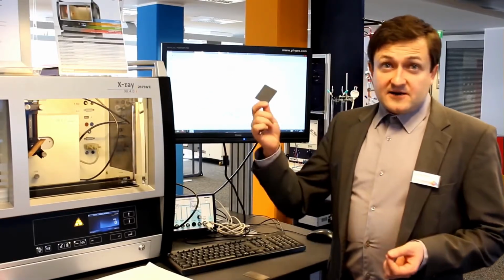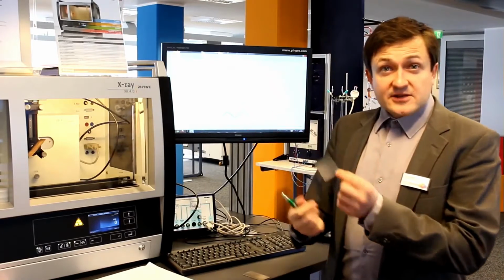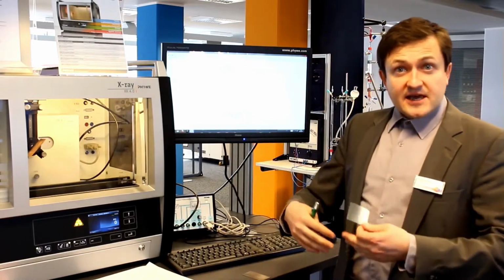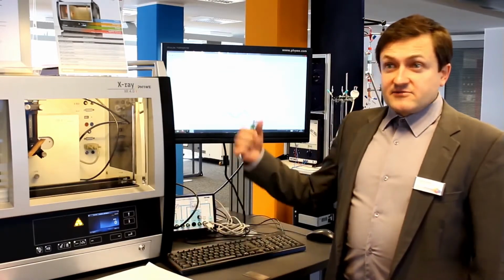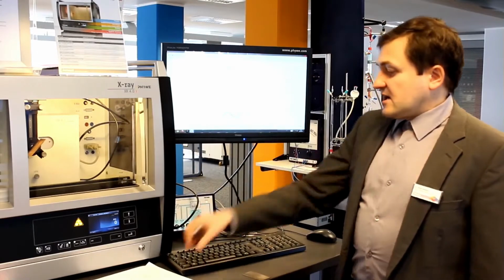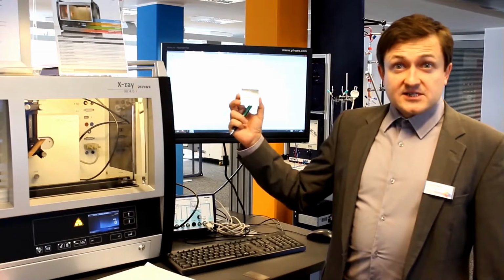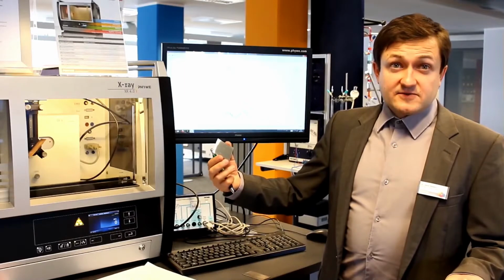The matrix effect is how the metals influence each other inside the alloy. For example, low energy photons from one metal inside the alloy can be absorbed by another metal, or the effect can even be increased, so the fluorescence of one metal can produce secondary fluorescence of another metal. And real industrial machines, of course, need more perfect calibration materials to make quality control of metal alloys, for example.